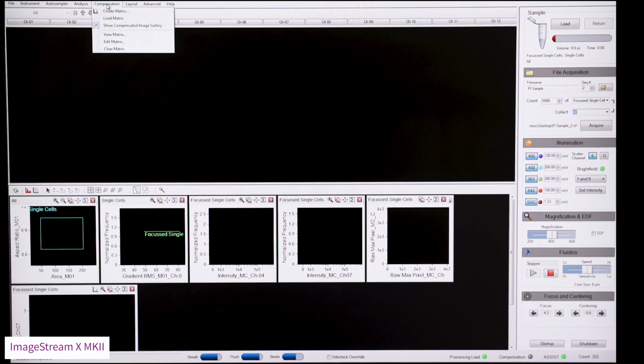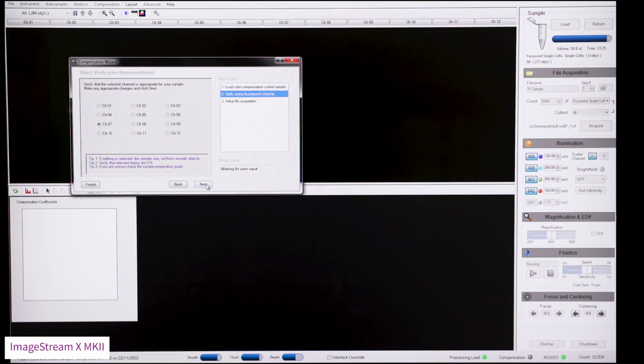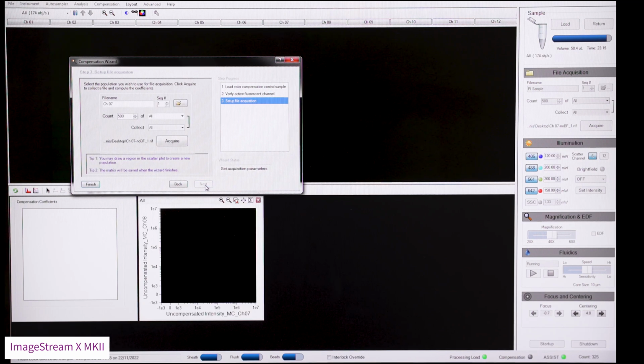So I'll start by clicking File, Load Template. Go to Compensation and press Create Matrix. It asks you to load the single colour controls. So press Load, put the sample in and press OK. Verify the system finds the correct channel. And it's got it right, this sample is brilliant violet 421, which is in channel 7. So we can press Next. Set the acquisition file name, destination and population to save and press Acquire.